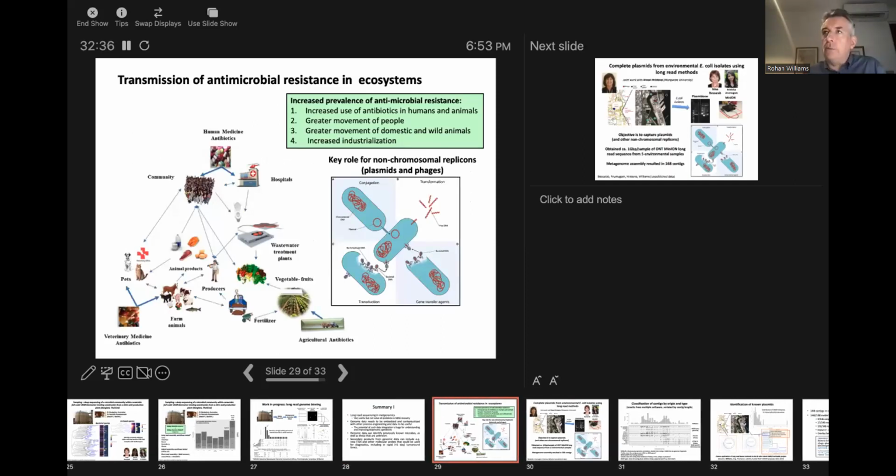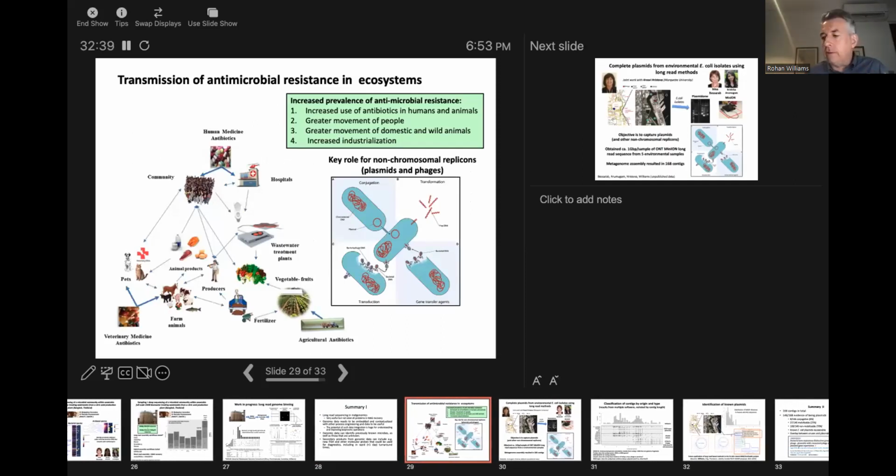What I am going to finish off with, and I have a few minutes left, is talking about how long-read sequencing technologies can be used to study this important problem of antimicrobial resistance, which, as we all know, is emerging as a massive public health problem on a global scale. And it's a very complicated problem because of the complex interrelationship between human and natural ecosystems, and also our agricultural and animal husbandry procedures basically drive this problem.